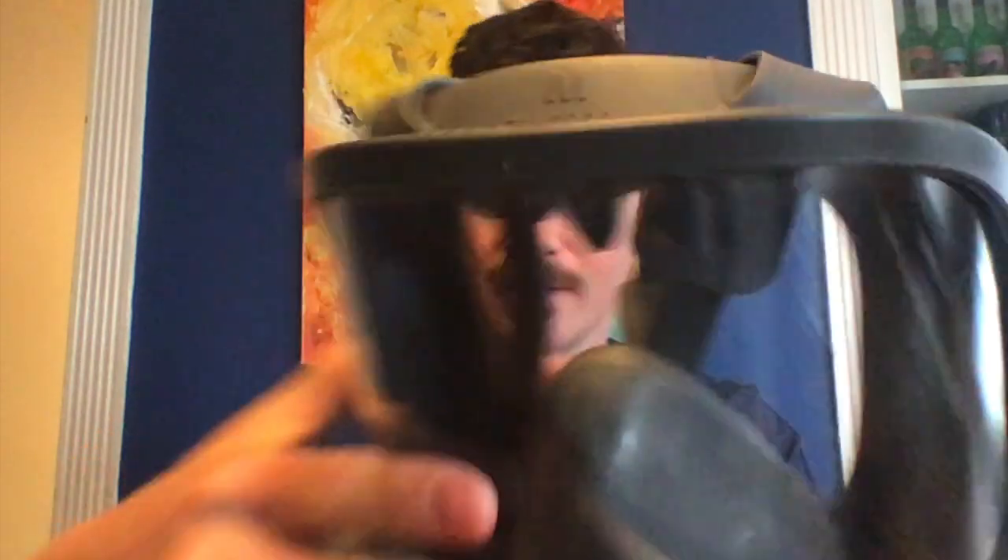So the first mask I purchased is a 3M 6800 series — it's a pretty versatile and pretty common mask. I went with a full face shield because I don't want to touch my eyes on shift. If you do a half mask with goggles, that's fine, but we know from the WHO that we need to protect our eyes, mouth, and nose from getting COVID.